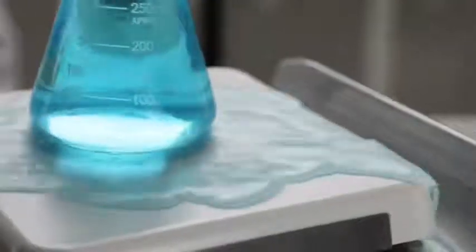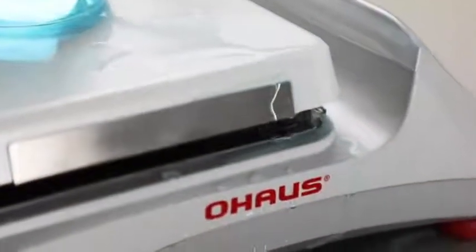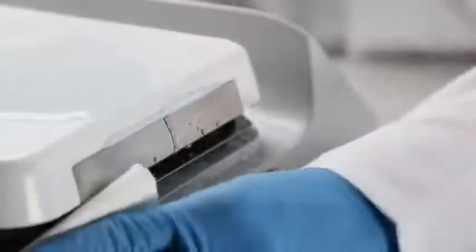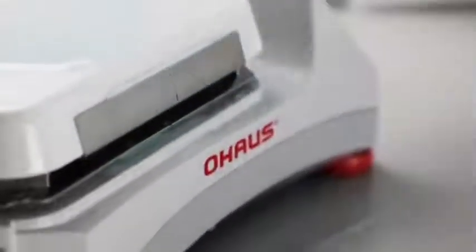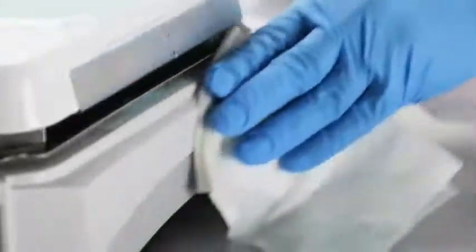Guardian 5000 series hot plate stirrers are designed for durability and safety with its innovative chemical-resistant smart housing — an easy-to-clean design that channels away spills from internal components and the control panel while remaining cool to the touch at high temperature settings.